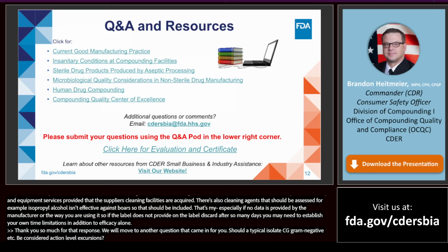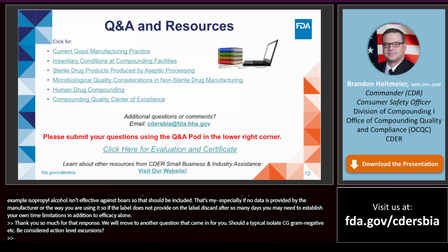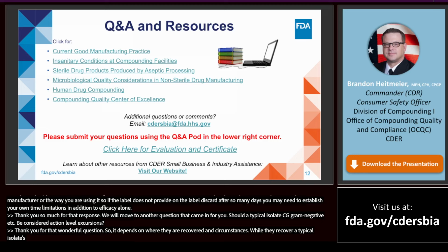Yes, thank you for that wonderful question. So it depends on where they are recovered and the circumstances. While the recovery of atypical isolates, such as gram-negative bacteria or fungi, in your cleanroom may be cause for concern, the background details will likely dictate whether there's a need for a full investigation. So it depends where you are discovering this.